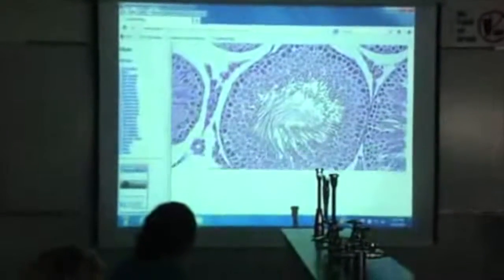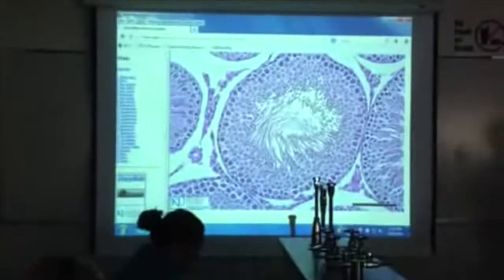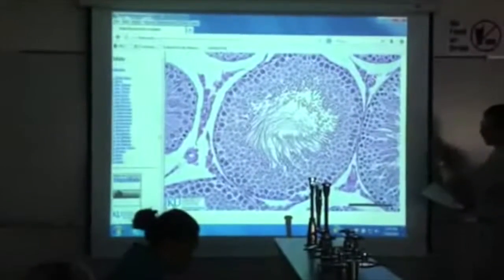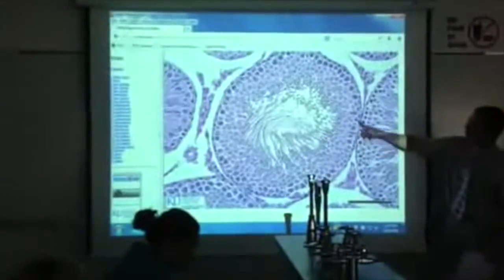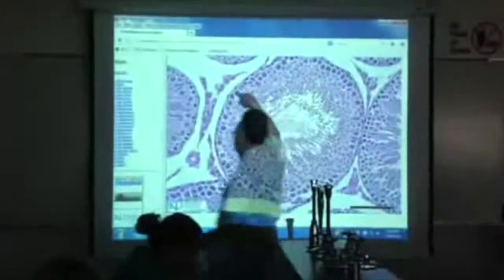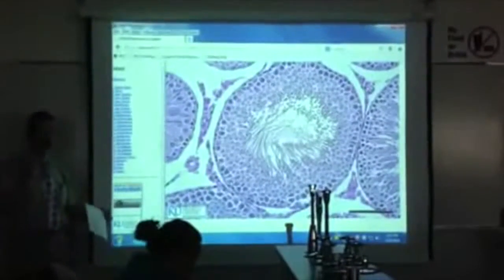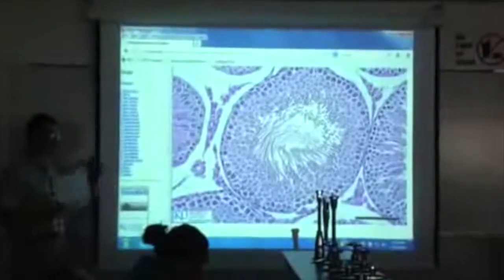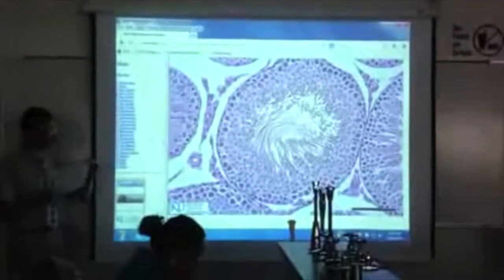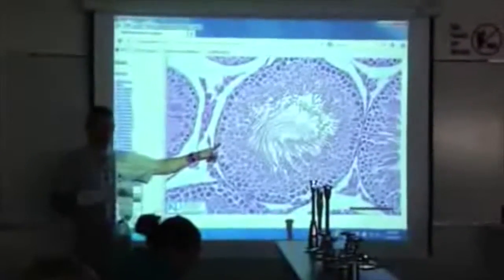Here's one seminiferous tubule. What you want to do in your head is go from the outside in. So, the cells on the outside, like these ones, what do you think their job is? From lecture, you learned this last week. Blood sperm barrier, because that's where we make the sperm, right? So what kind of cell would they be if they're going to generate sperm?